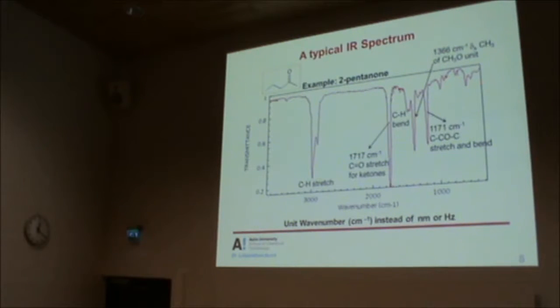And this is how a typical infrared spectrum looks. So you have a molecule. Let's say the molecule has a lot of bonds. For example, it's a CH3, CH2. So there's a C single bond C here, and then here there's a carbonyl bond. So if you record a spectrum, you will find peaks that correspond to some of the bond vibrations in this molecule. Okay, by looking at these peaks, you can tell, okay, there were these bonds in that molecule.